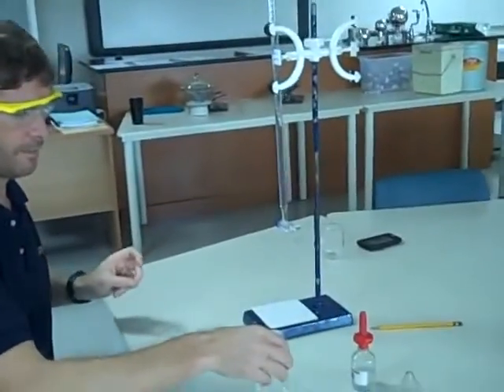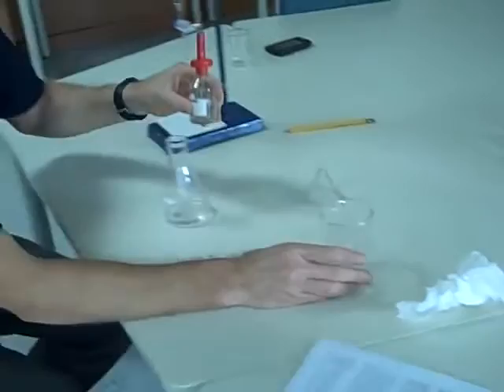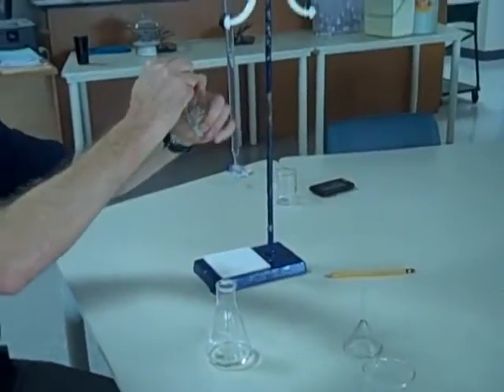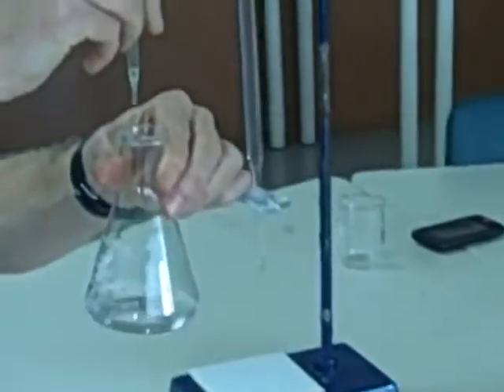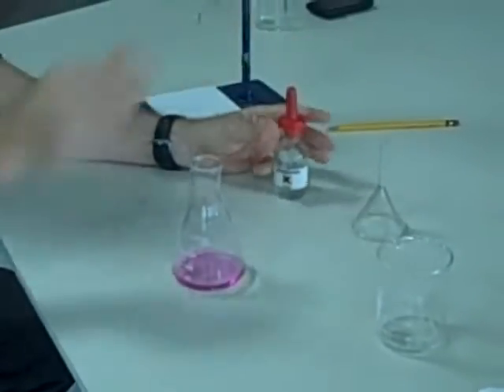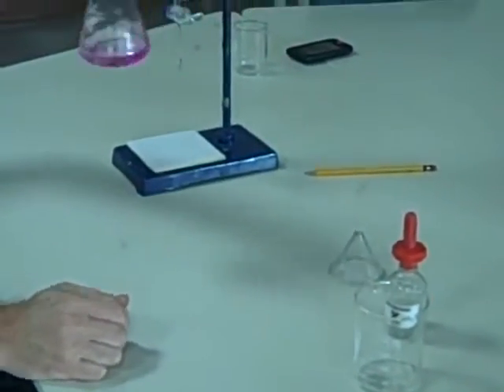I've got my conical flask. It asks me to add some indicator. I'm going to add about two or three drops of phenolphthalein indicator — one, two. I've got two drops and a nice pink colour. We will be titrating to the end point, which is when the colour of the solution just disappears.